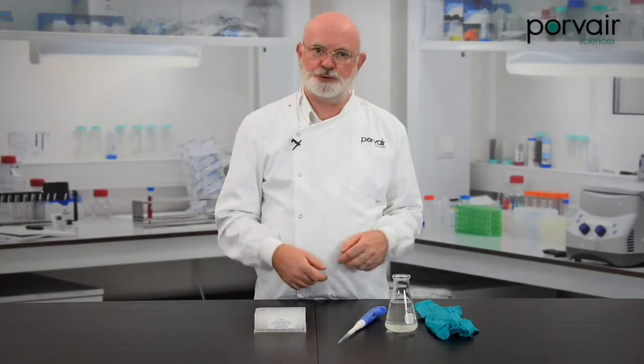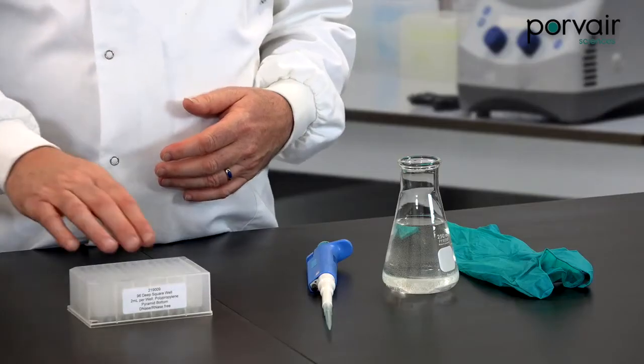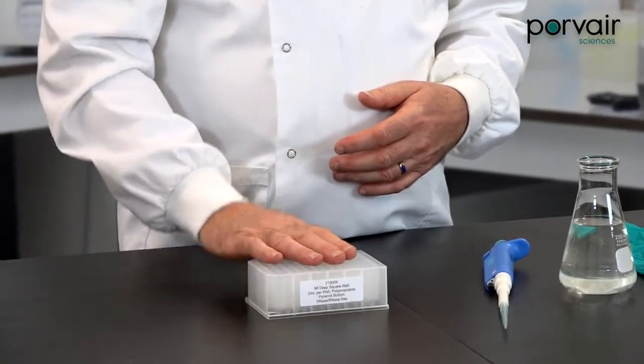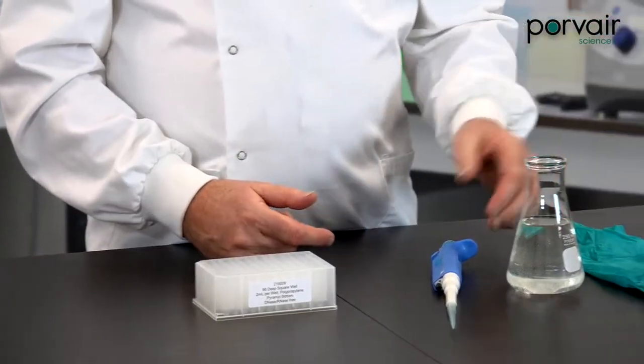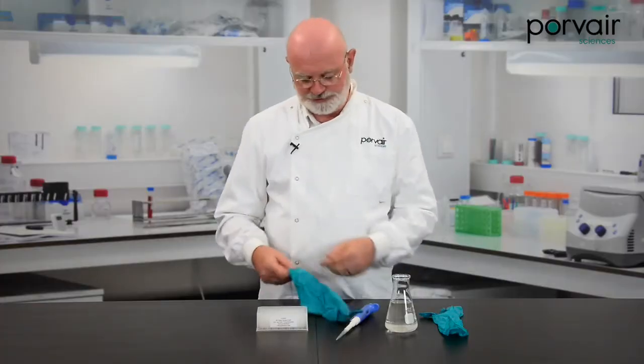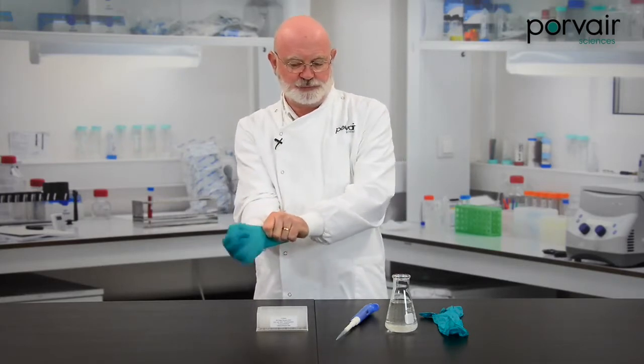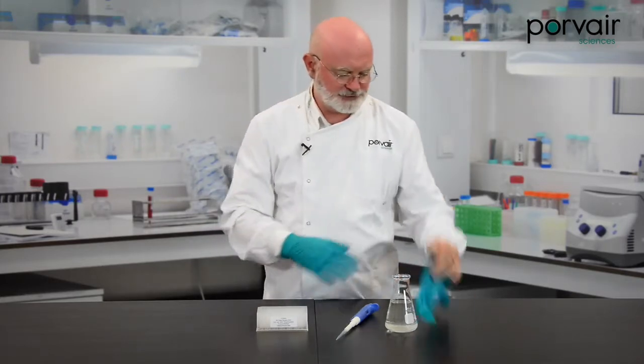I'd like to explain to you how we test for extractables and leachates on a routine basis. So I've got before me a standard 2ml deep well plate. We've got some methanol and the 1ml pipette. So I'm going to take up some of the methanol and just pipette that into some of the wells of the plate.